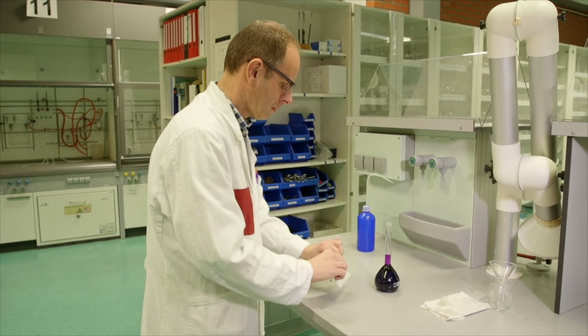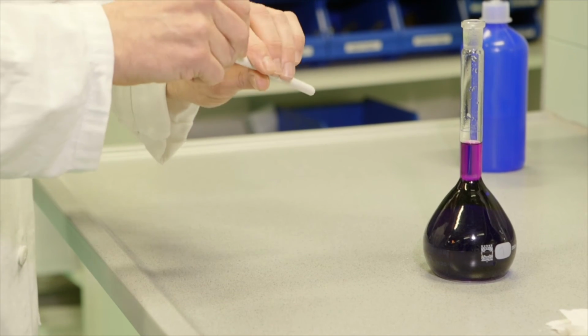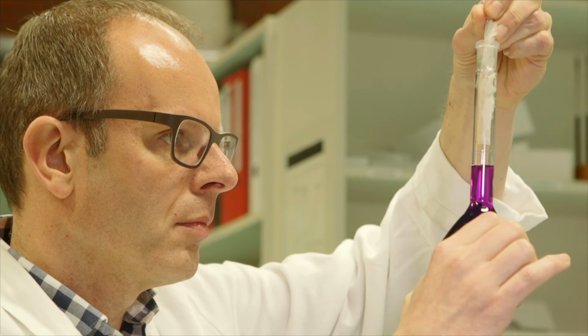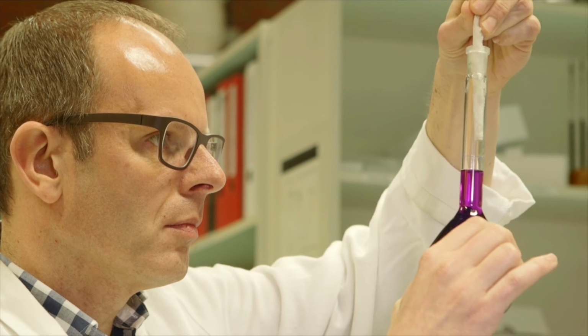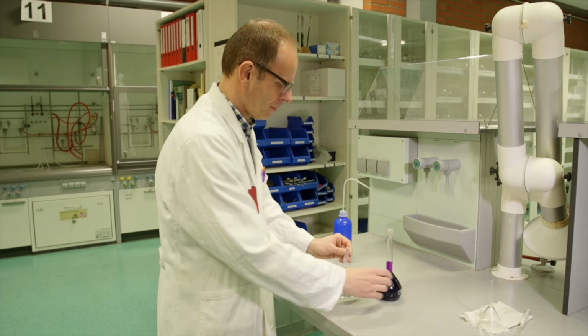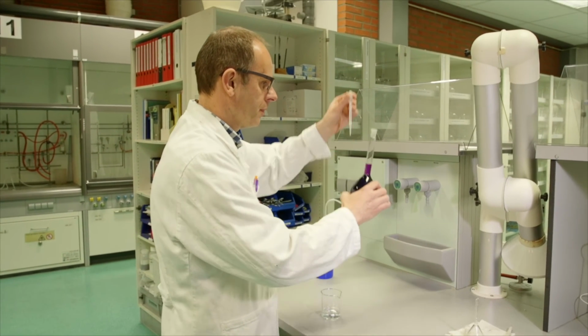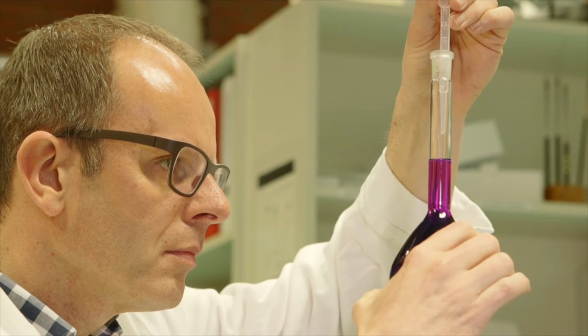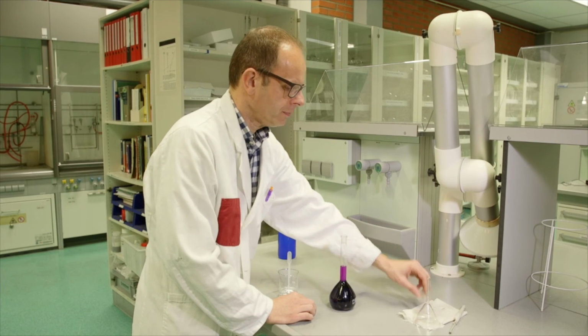A small piece of tissue is placed around the clean and dry stirring rod to dry the neck of the flask. The neck is only dried above the line. Using a Pasteur pipette, the solution is filled until the meniscus is brought to the line. A clean and dry stopper is placed in the measuring flask.